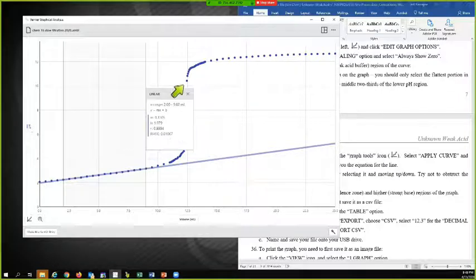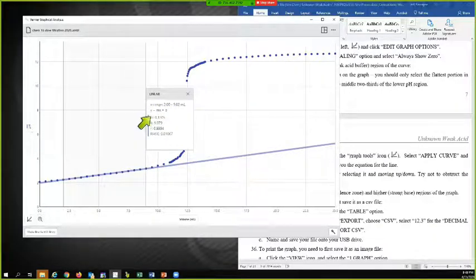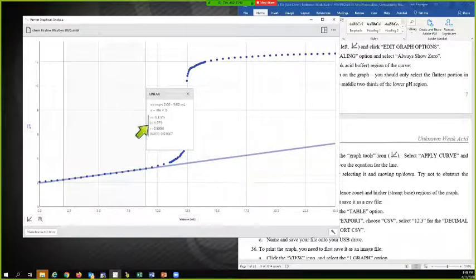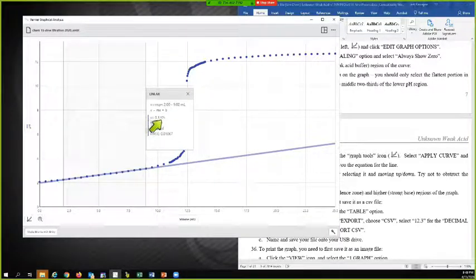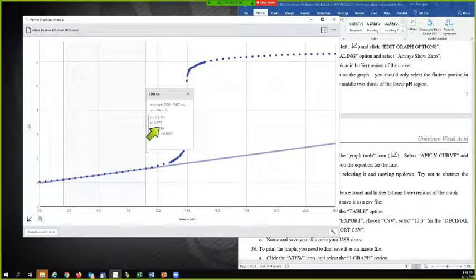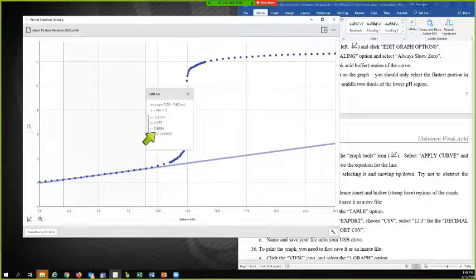And it's given me the information for that. It's telling me the x range. And for the equation, the slope is 0.1305. The intercept is 1.979. And r is 0.9994.